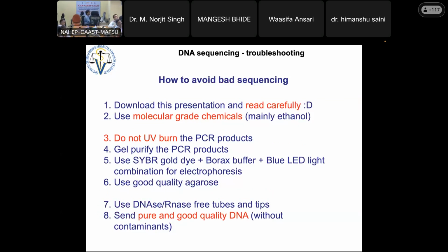Okay, so let's have some conclusions out of that. How to avoid bad sequencing? First, download this presentation and read carefully, because I have tried my best to summarize all the possibilities, and you also go through the videos. Always use molecular grade chemicals, don't use any cheap ones.